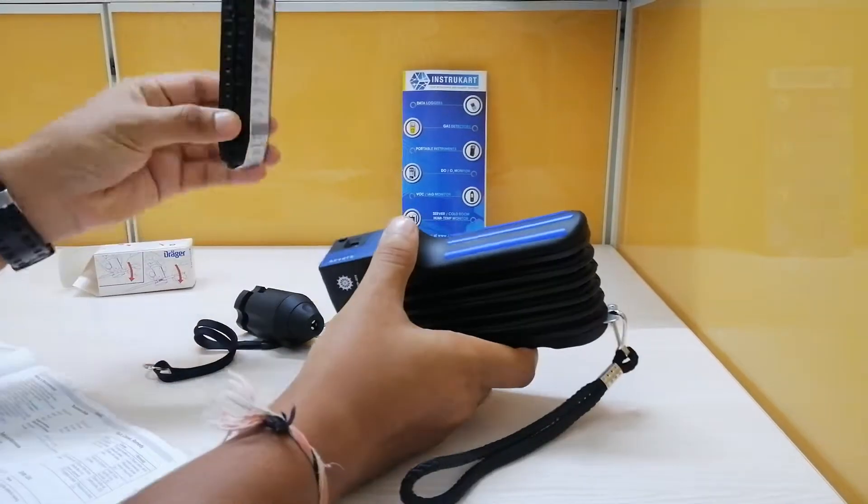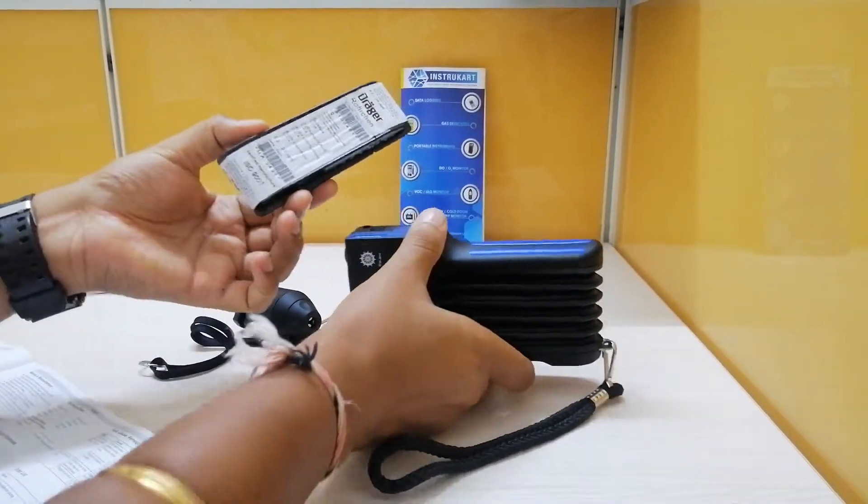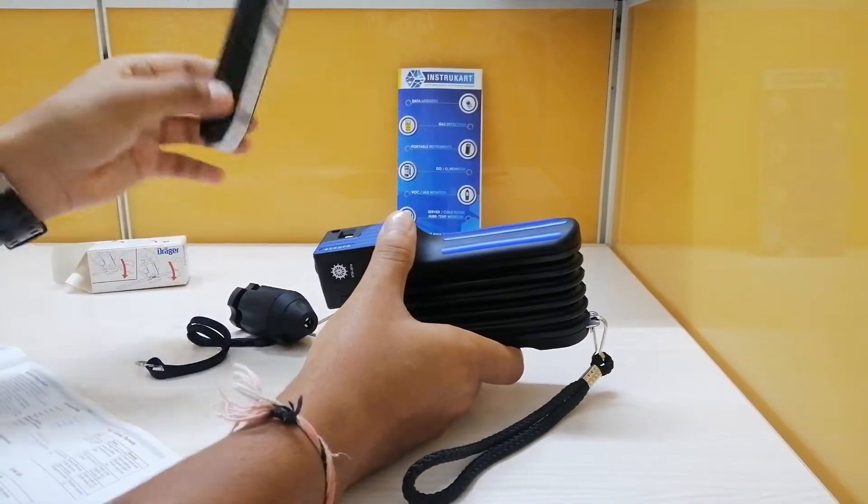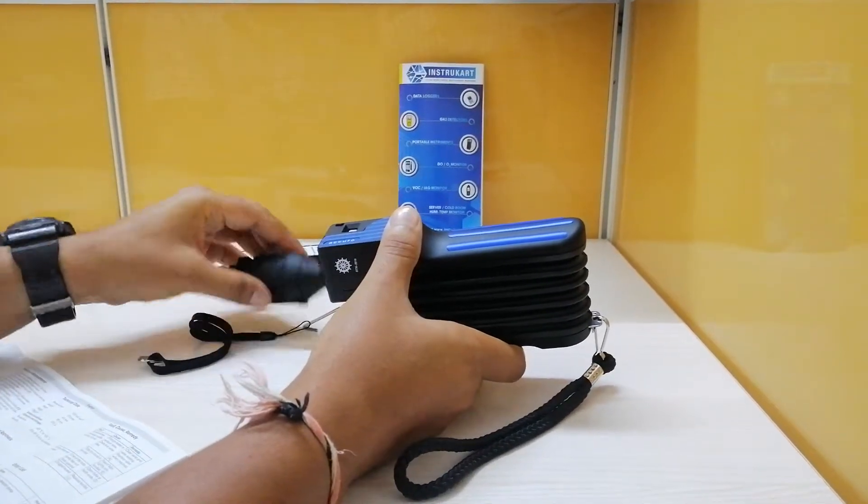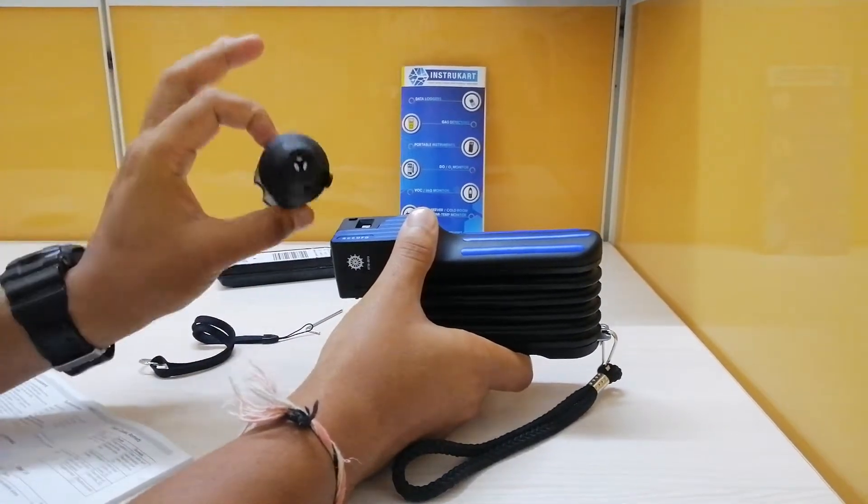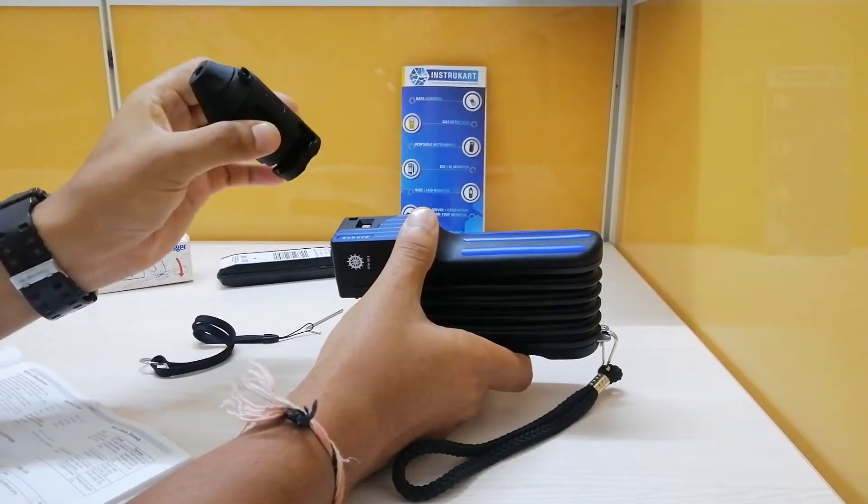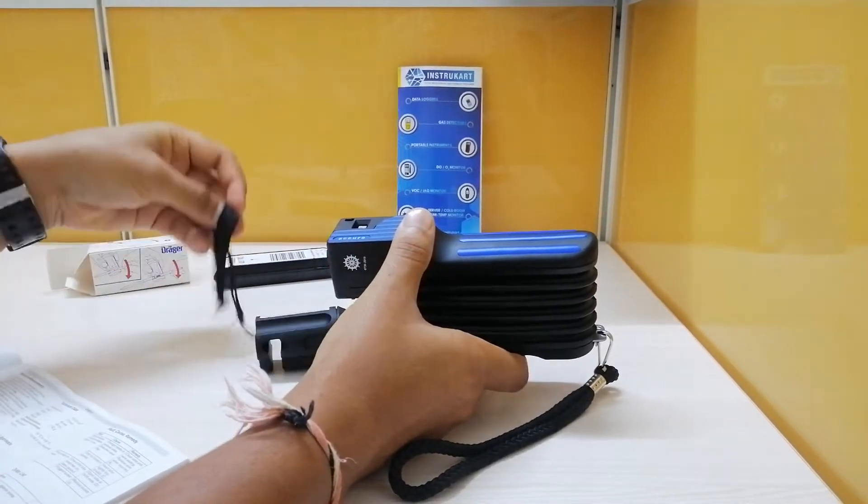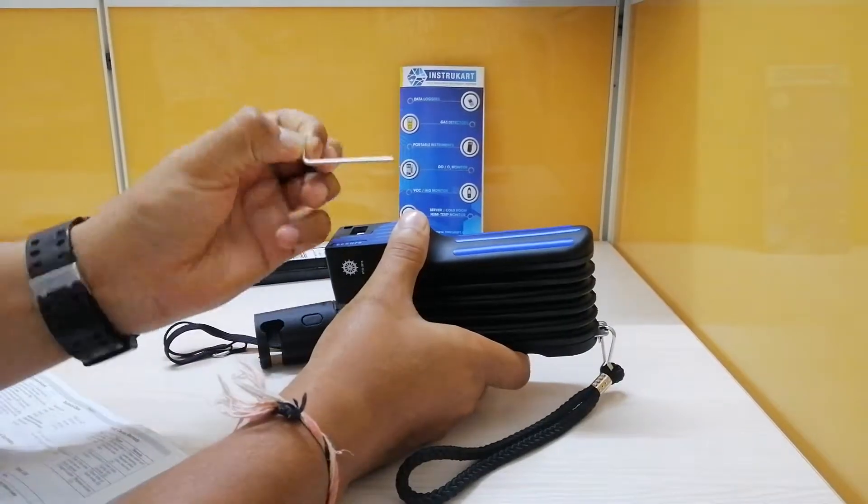Please understand that this particular tube has to be purchased separately. This is not along with this pump. The standard accessories which come with the pump are this glass tube opener, this trap, and an Allen key.